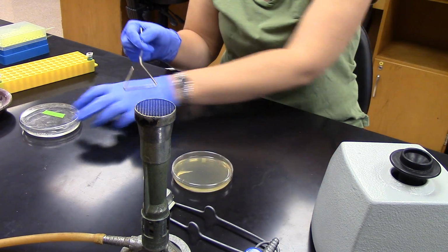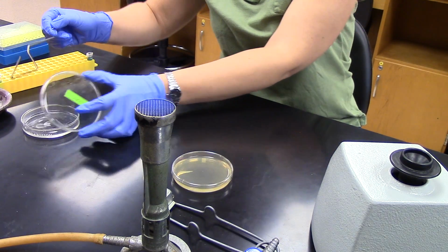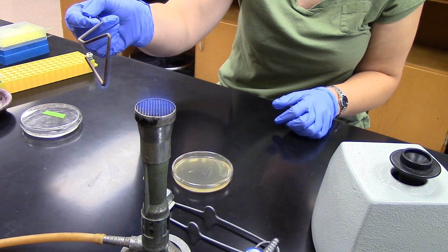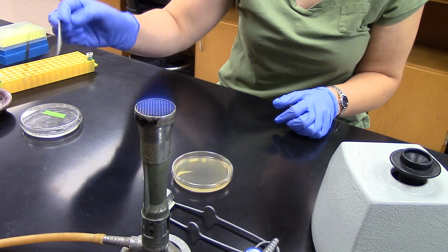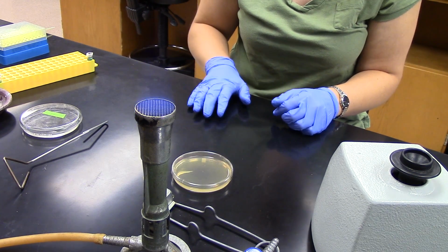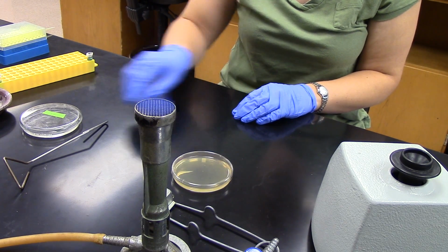Put the lid back on, and it might take a minute or two for the plate to dry. When you're done, you always end by re-sterilizing the spreader so you're not taking your bacteria, yeast, whatever, and putting it onto our clean countertop. Another thing I want to mention that students sometimes mess up is they overheat the spreader, so don't leave it in the flame.